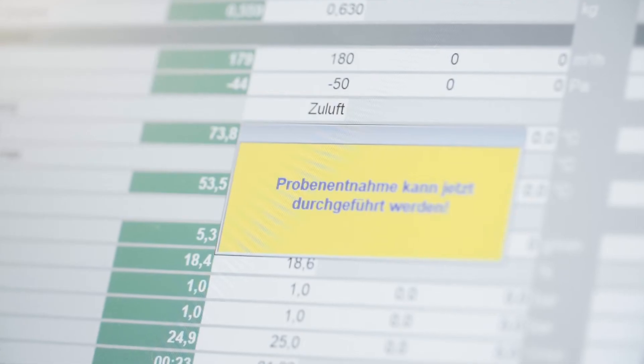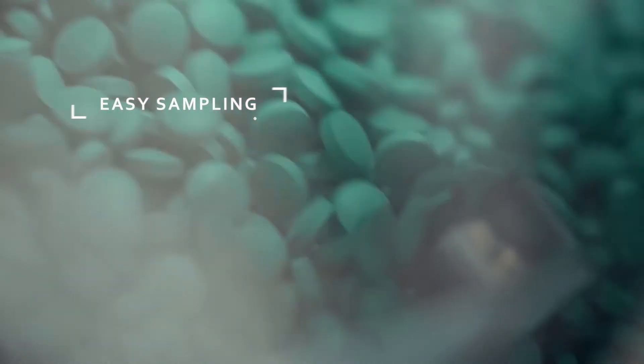During film application, samples can be removed with complete ease at any point.